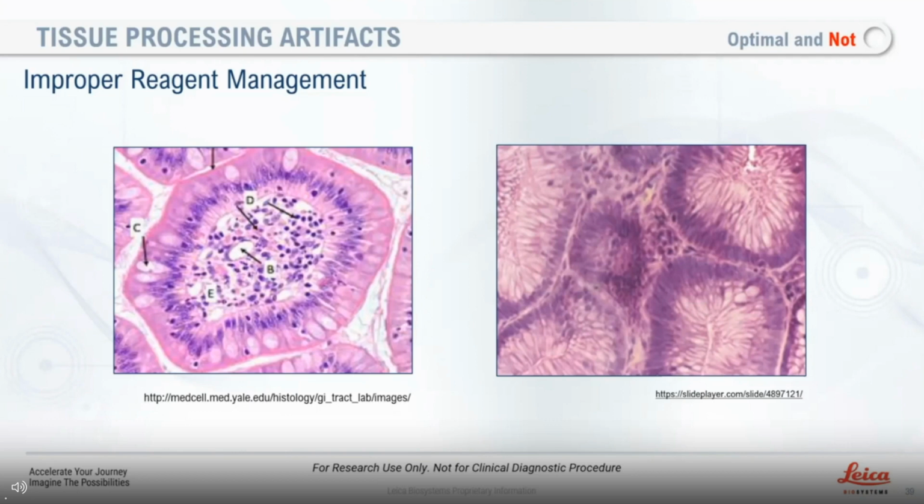Also, we talked about in the presentation, if a specimen is over 3 or 4 millimeters in thickness, then you're compressing the tissue when you shut the lid, and restricting access of the fluids to process the tissue. The other one I can think of, which I think is common in the life science arena, is to only have maybe 1 or 2 protocols. If you are sharing a core facility, different projects might entail different species to be studied.